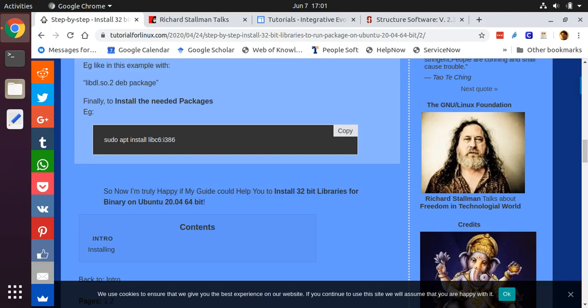If you don't have a computer running the Ubuntu Linux operating system, fear not. You can use virtualization software to have Ubuntu Linux running on top of your Windows or Mac OS X computer. The software to do that is called VirtualBox. In fact, I am running my copy of Ubuntu Linux right now within VirtualBox on my Mac computer. For instructions on installing Ubuntu Linux within VirtualBox, please see the notes accompanying this video.